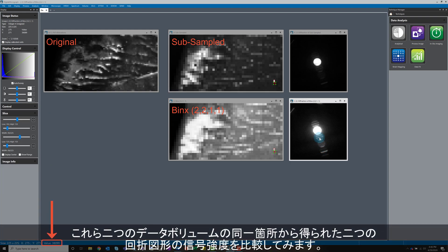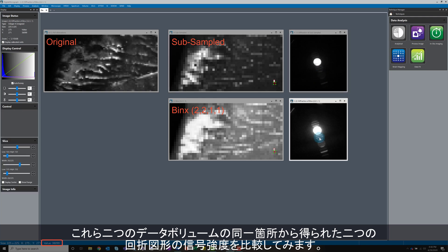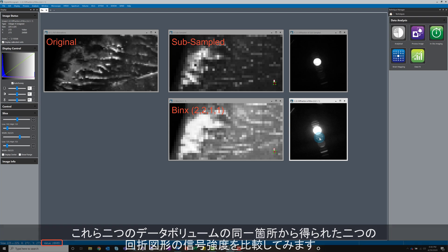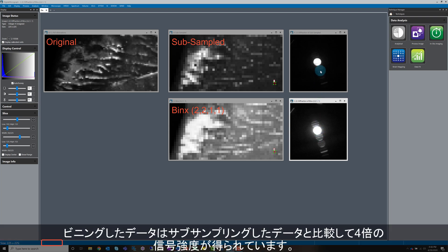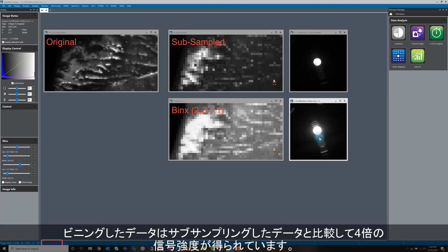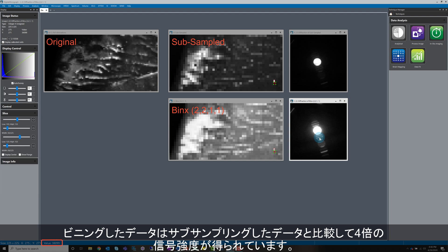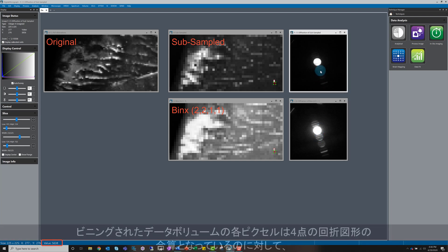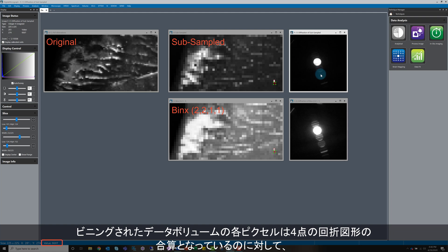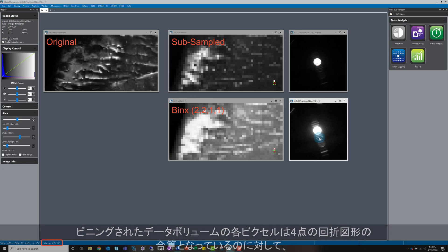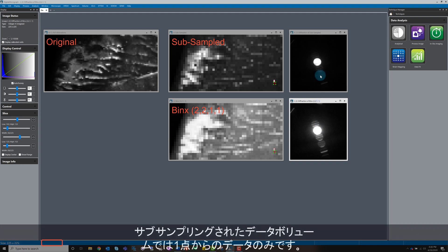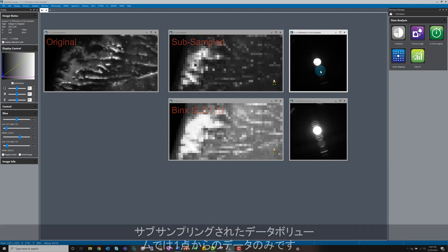Let's compare the two. You can see the difference by comparing the intensities in two diffraction patterns from the same location in the two volumes. The intensity in the diffraction pattern from the binned data is 4 times higher than the sub-sampled data. Each pixel in the binned volume contains the sum of 4 diffraction patterns, as opposed to only 1 diffraction pattern in the sub-sampled data. So the results make sense.